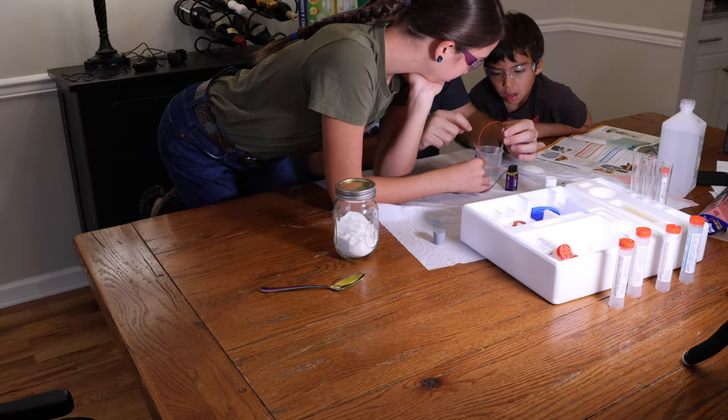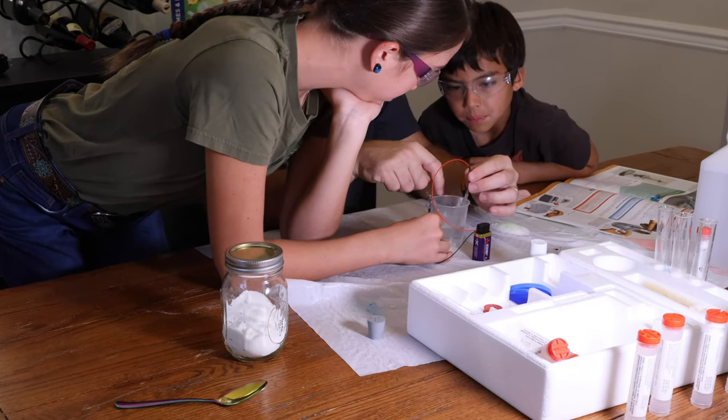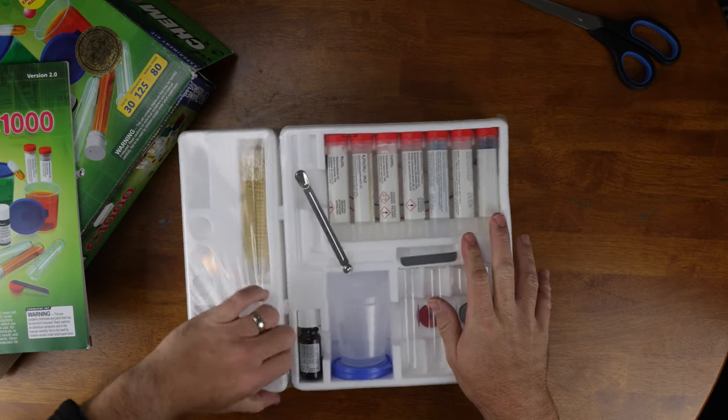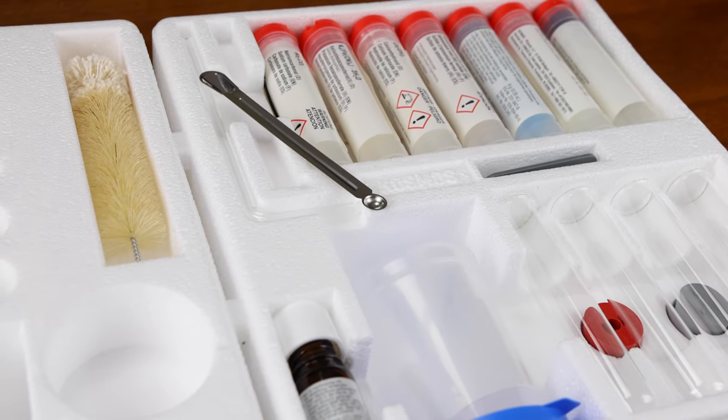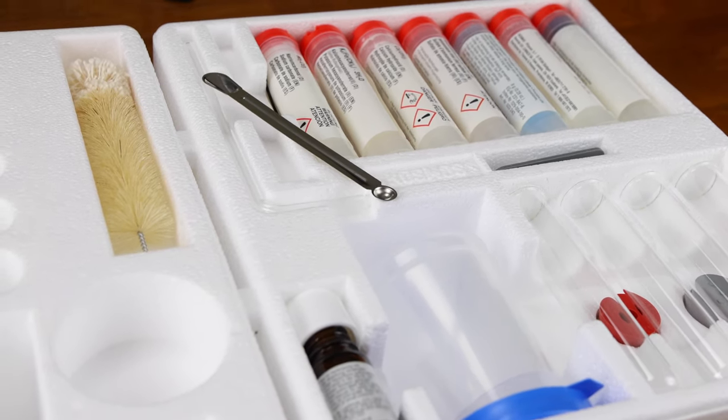So the three things this kit has going for it are: the excellent booklet, the really creative and fun science experiments, and the kit itself — which includes an experiment tray that is organized and comprehensive without the need to buy extra equipment like beakers or other chemistry hardware.